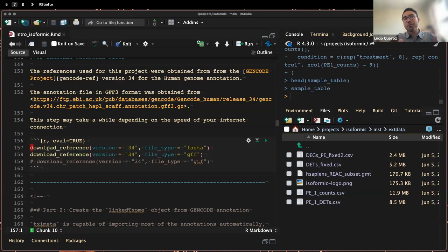That right now, most of the databases, most of the work that has already been done, usually don't go that deep. And actually, there is plenty of data already available from published studies that can be reinterpreted at another level. And every day, new annotation comes. So yeah, I hope we discussed a bit about that.